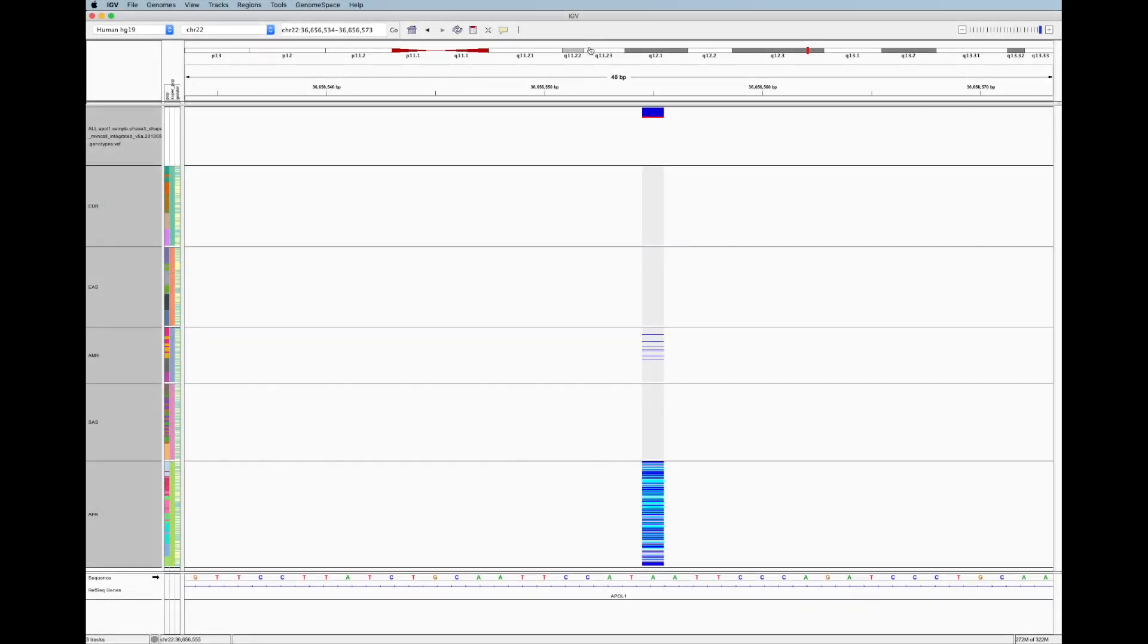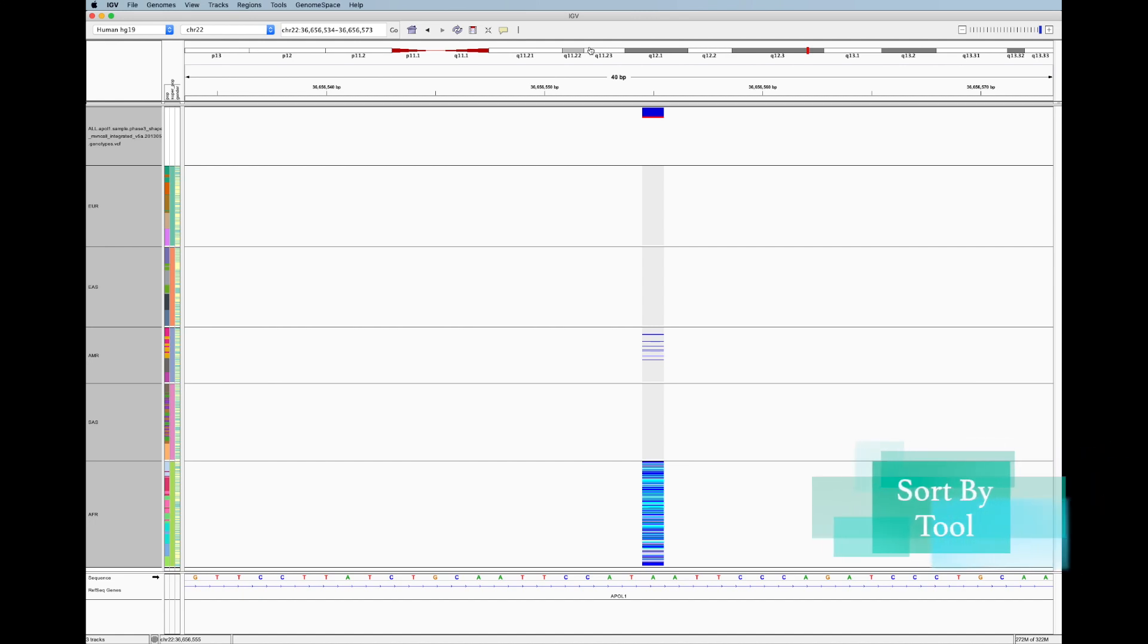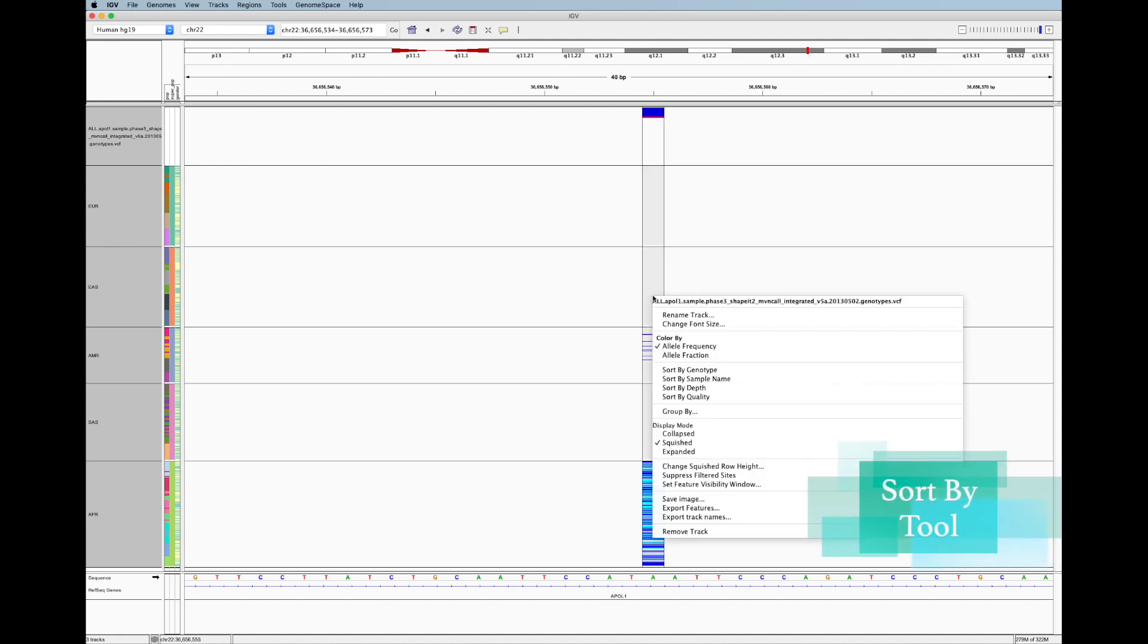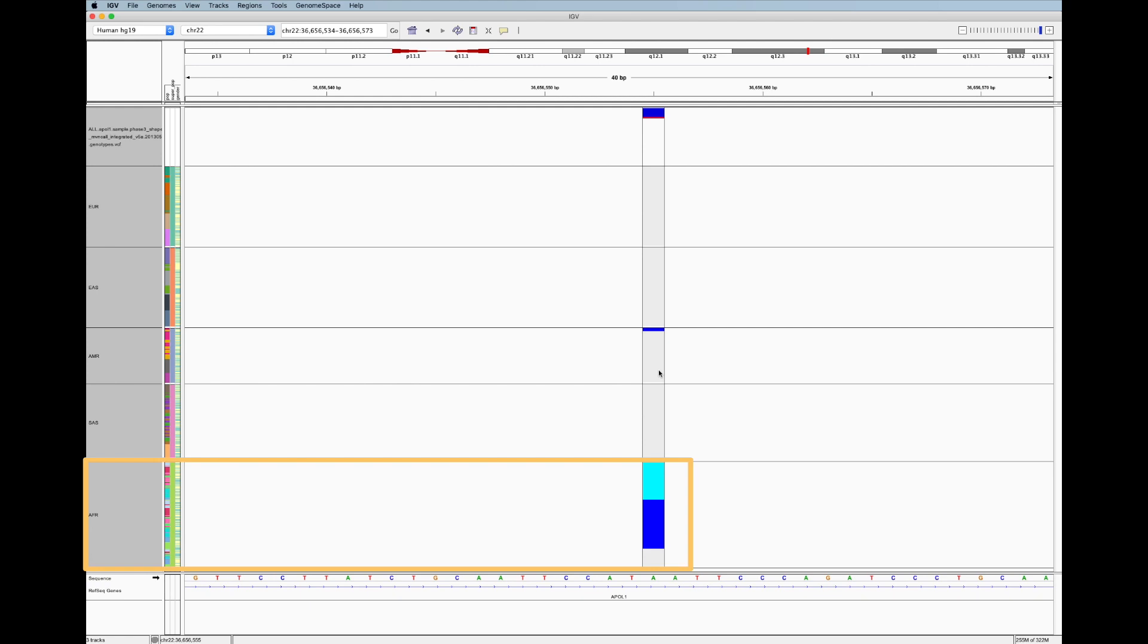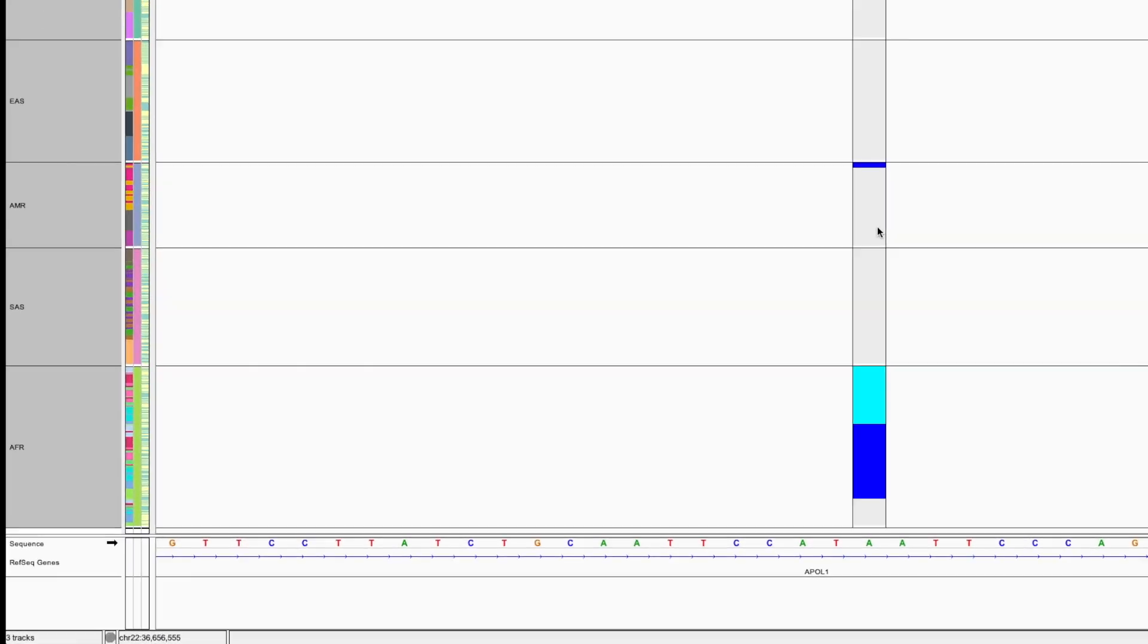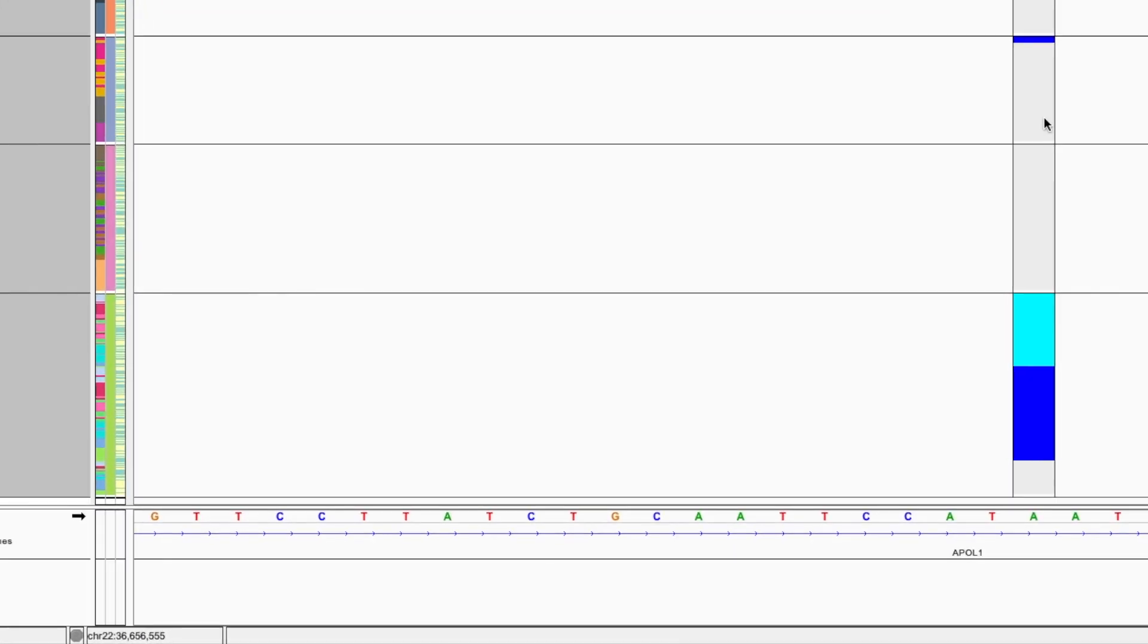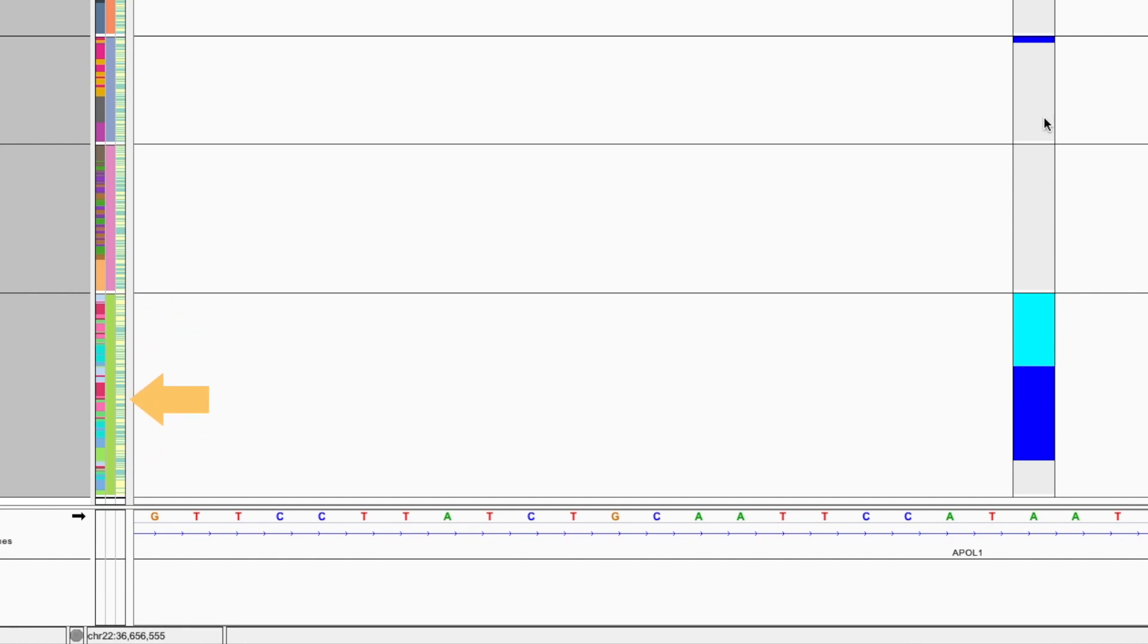Once you've found a variant that interests you like this one, IGV lets you sort the samples according to their status at this variant. For example, if I right click and select sort by genotype, IGV is going to sort the samples according to their genotype at this variant within each superpopulation. With this view, I can see that the heterozygous genotype is slightly more common than the homozygous genotype, and I can see that this variant seems to occur equally often in males and females.